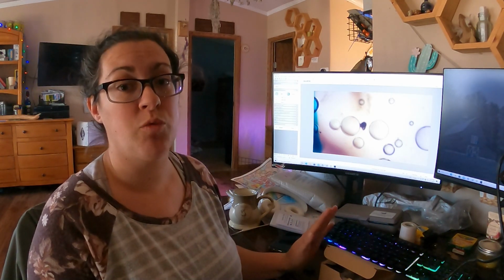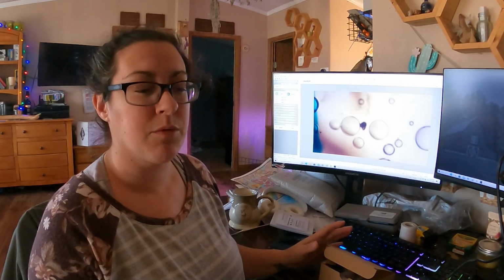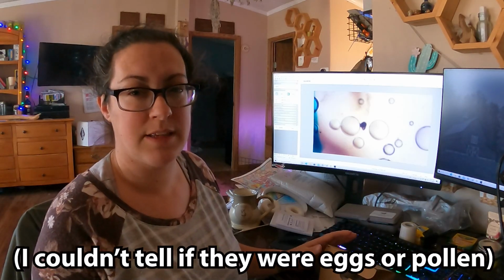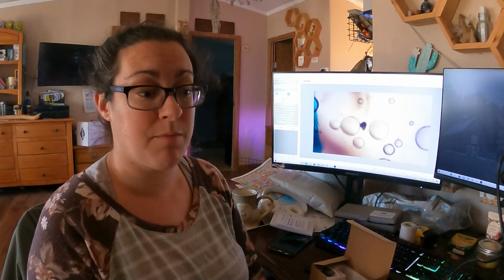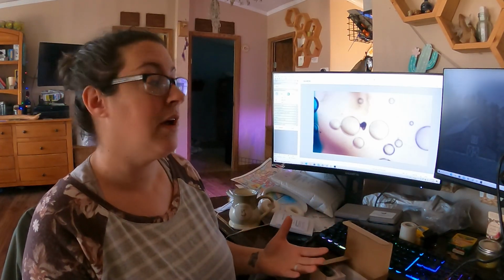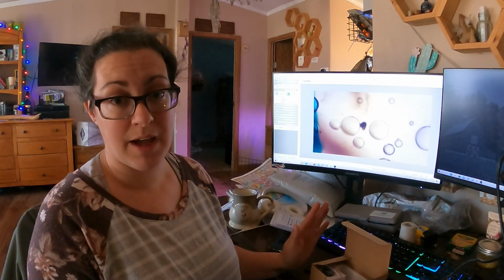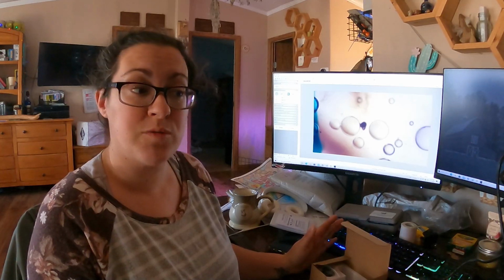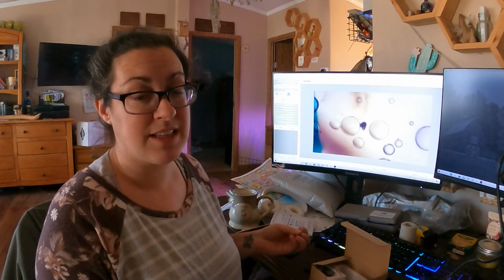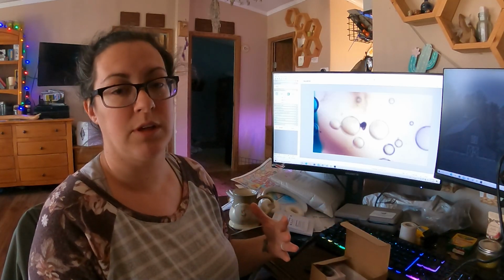And these are literally the only 2 eggs that I can really tell are here at all on both of these slides. There were a couple other potential eggs that I could consider, and as I get better at doing this, I'm going to be a lot more sure. But what I do know is I've only got less than a handful of eggs on the whole slide and 1 worm, which according to my calculations means that she does have a very, very low worm load, which makes me really happy. That is kind of expected this time of year, but I really want to get to know this type of equipment. I really want to get to know this process before I really need it, before I have a sick goat.